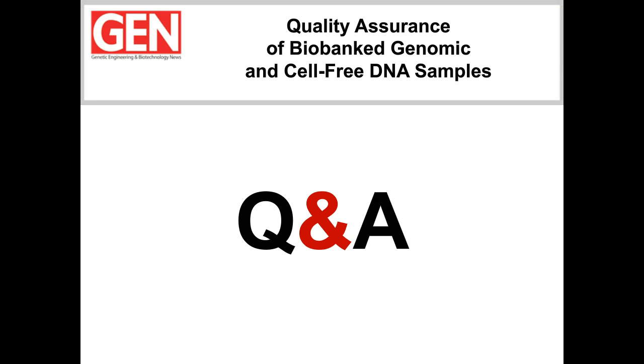Library DNA, most of the libraries are a little bit smaller in size, so here we would recommend, depending a bit on the concentration, either the D1000 screen tape assay or the high sensitivity D1000 application. Again, make sure that you are working in the linear dynamic range of the assay of choice.